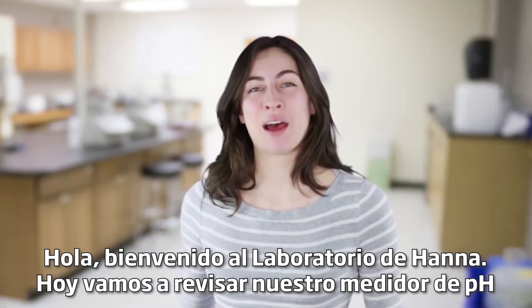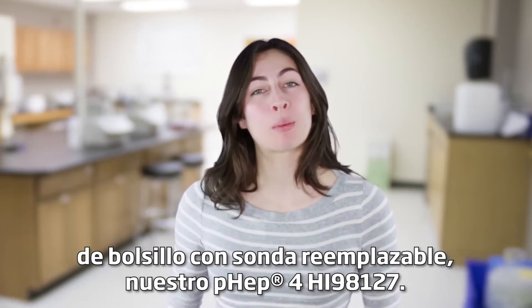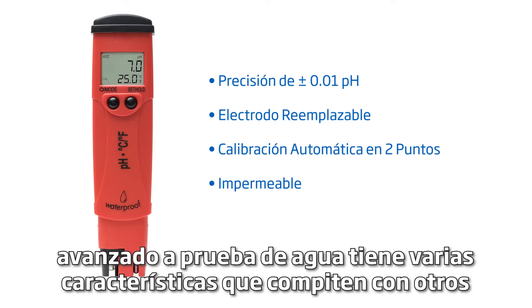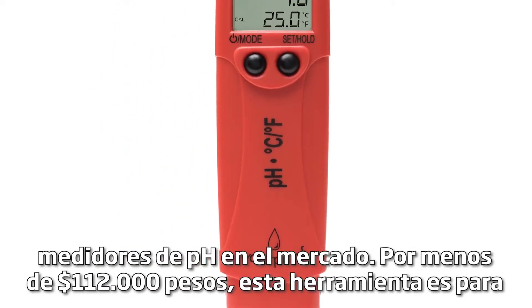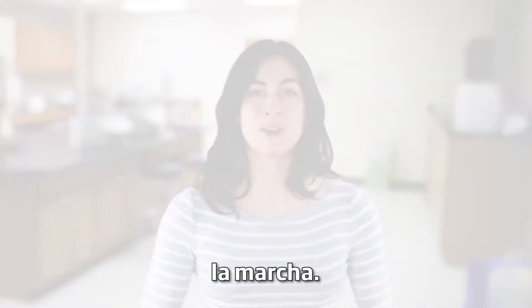Hey guys and welcome to the HANA Lab. Today we're going to go over our pocket pH tester with replaceable probe, our FEP4 HI98127. With an accuracy of plus or minus 0.1 pH and automatic two-point calibration, this advanced waterproof pH tester has several features that compete with other pH meters on the market. For under $100, this tool is for any business or hobbyist that needs quick, reliable pH measurements on the go.